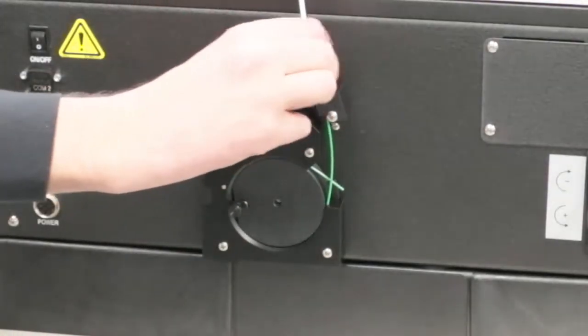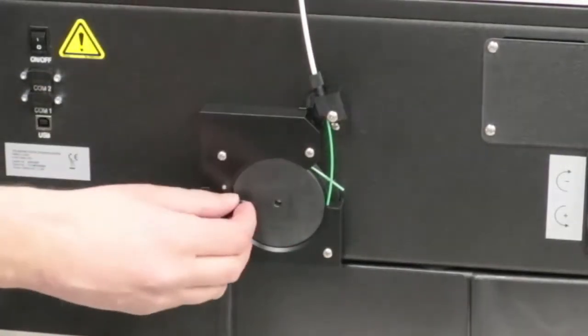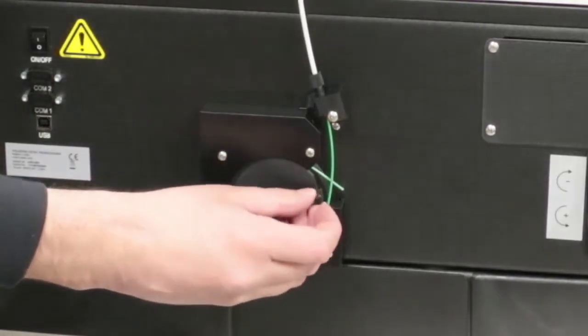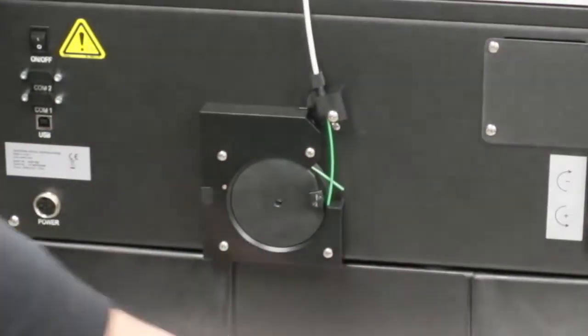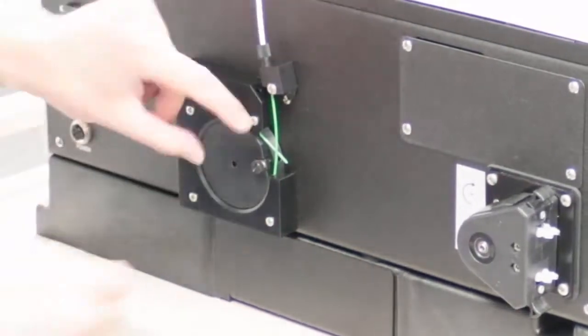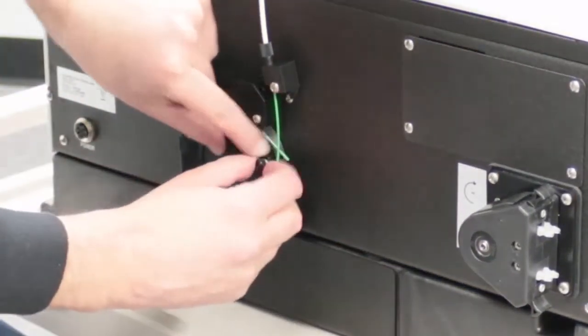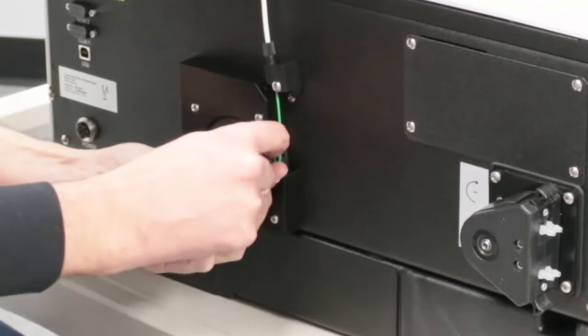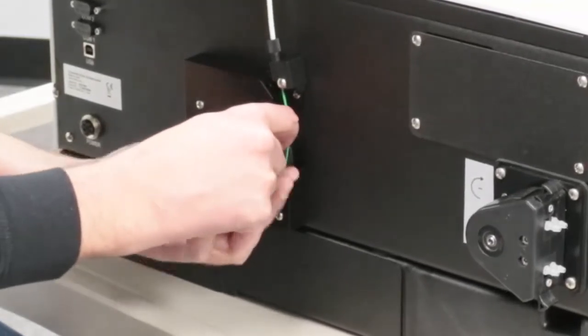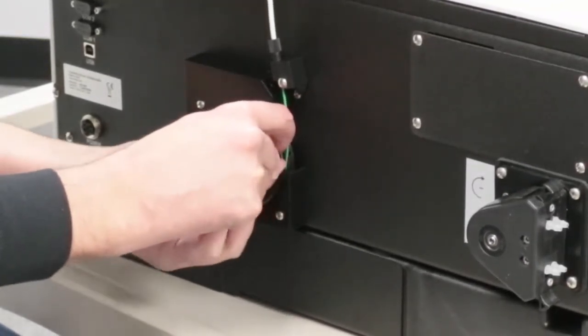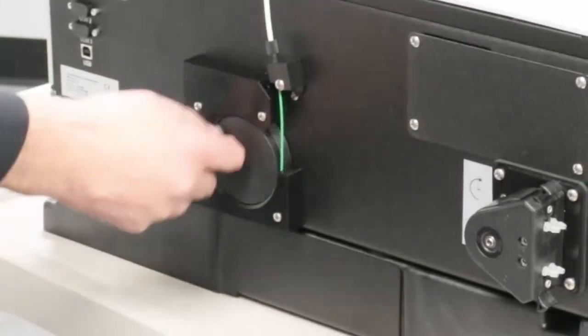Then tighten the nut on the swivel block. Adjust the end of the cable and push it under the clamp on the rotor. Using your fingers, tighten the thumb screw on the clamp.